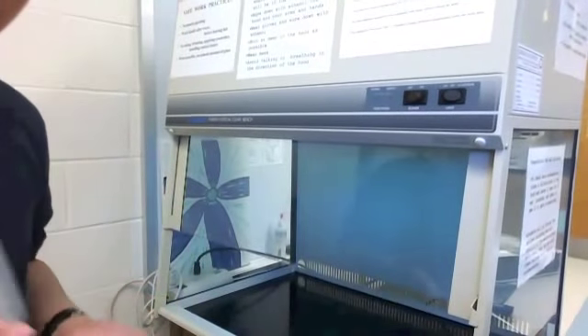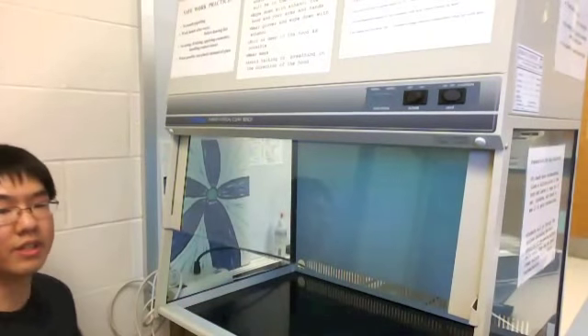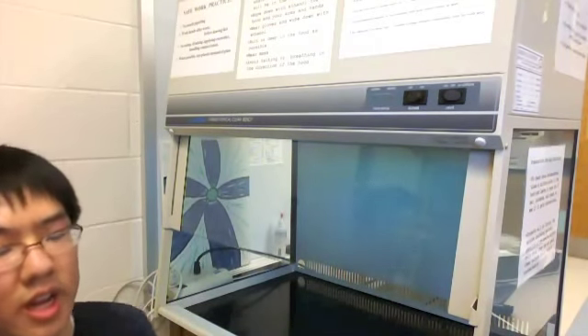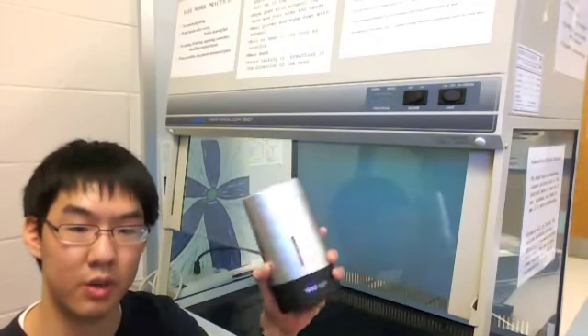This is the little environment where you work, culture your things, and transfer bacteria. Basically, right now I have a UV light on, which kills any bacteria inside this machine. As you guys may know, UV light kills germs, and that's what this sanitizer is supposed to do on a smaller scale.